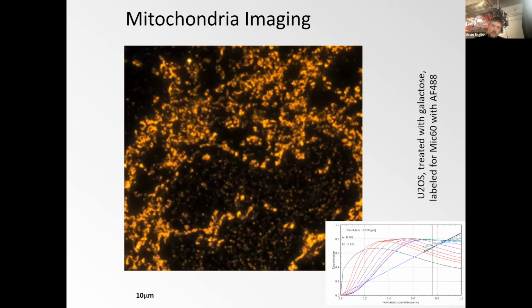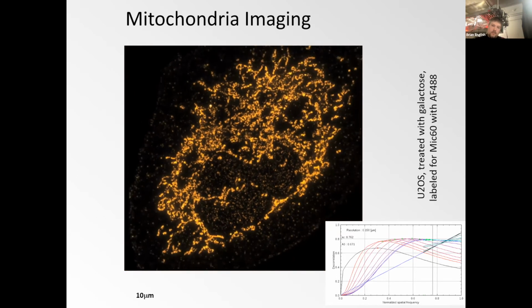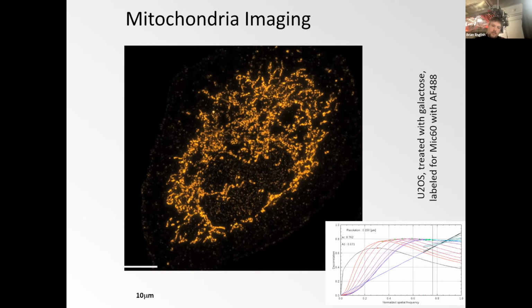So for the bead resolution, you can argue that measurement on beads is often a bit optimistic, and it maybe is; it showed maybe a bit lower than 150. But even in a cell context, at least a single cell context, we can also get this doubled resolution capability.